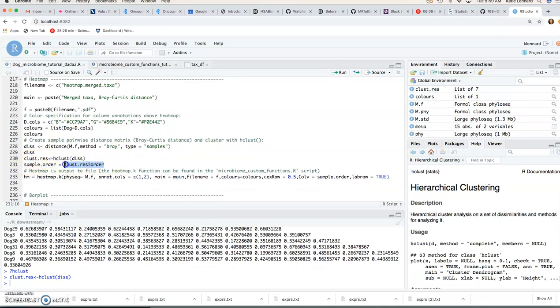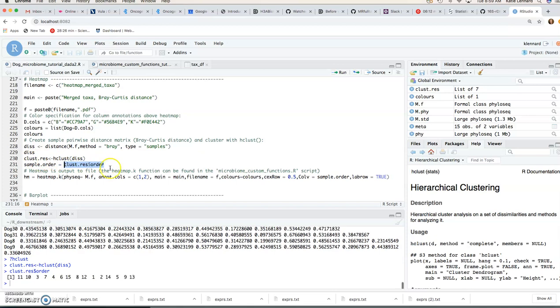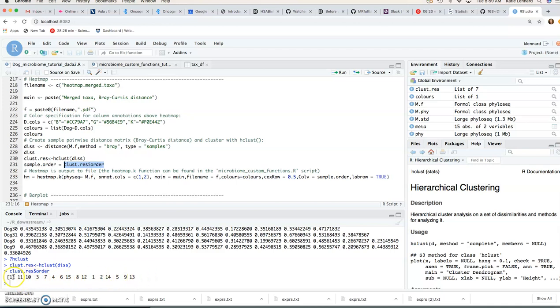So that's from the stats package, hierarchical cluster analysis on a set of dissimilarities and methods for analyzing it. So if we do hclust, we can extract the sample order from that object by saying clust.bray$order. So there we can see we've got 15 numbers here and that specifies the sample order for the hierarchical clustering that we'll pass on to our function.